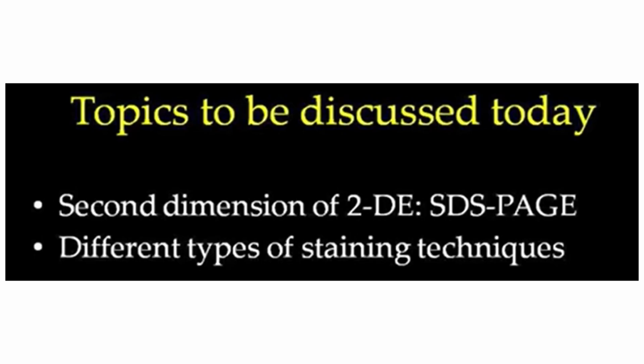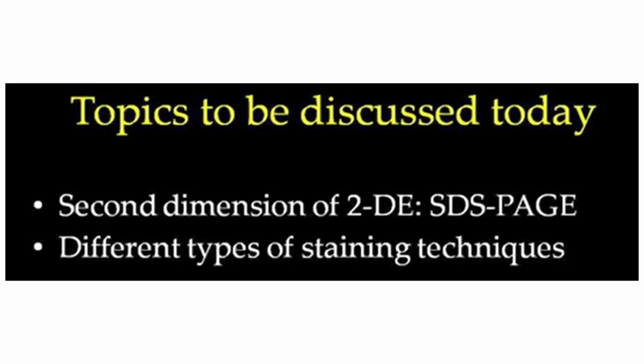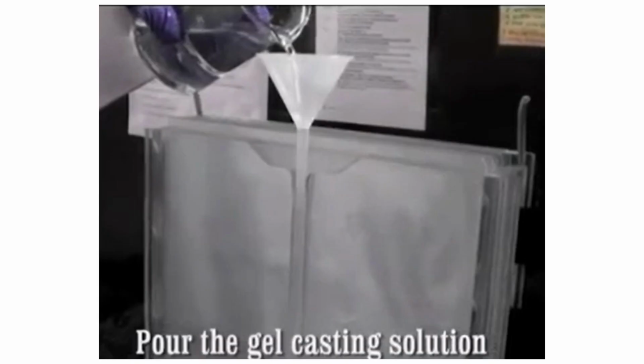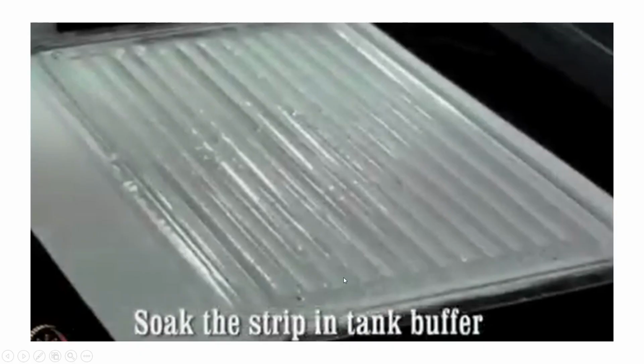Then in terms of the second dimension, that is SDS-PAGE. So before talking about this, they also showed a bit of the practical side, how exactly gels are made and how they are equilibrated, etc. So this is about gel casting. This is how an IPG strip looks like. And this is a tray wherein you equilibrate it, so you can keep the IPG strip in this tray and add the equilibration solution for 10 minutes each. You need to do it twice. So that's how it looks like.